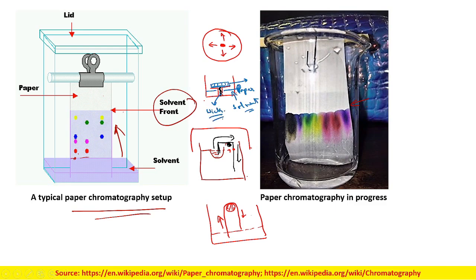Okay, just like the lamp wick, there will be a wick, and on the top of that you place your paper. Now at the central point, it is getting the solvent. Now this solvent will try to move towards the outer diameter of the paper, and while it is doing so, the chromatograms will be forming circular bands all throughout.